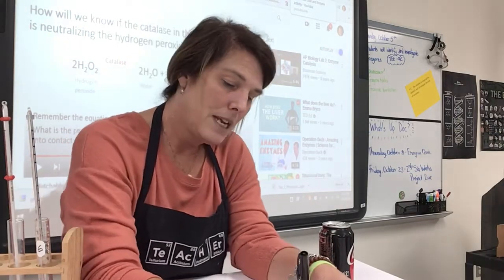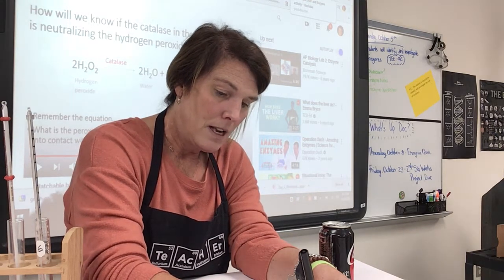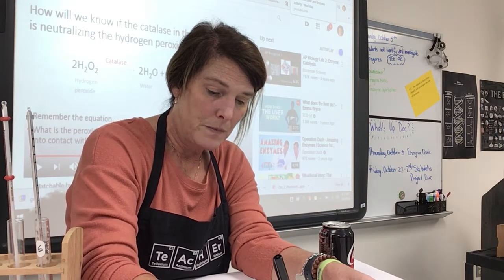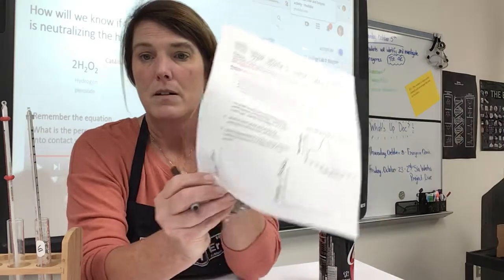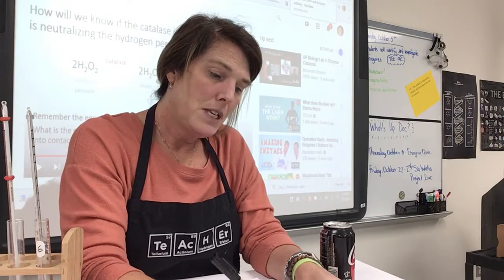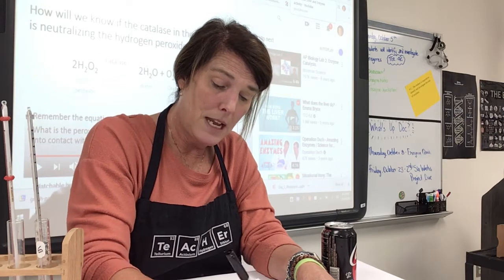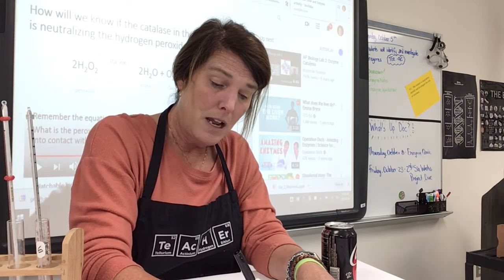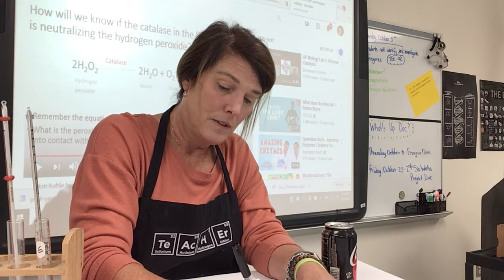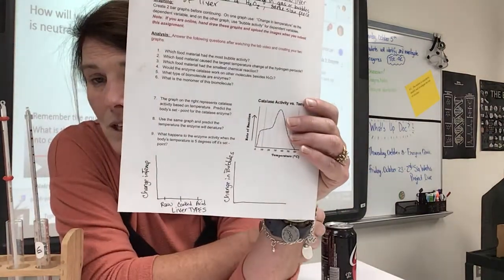One we labeled a change in temperature, and the other one we labeled a change in bubbles. So we have 2 graphs. Down at the bottom, it's a bar graph, and remember we had raw liver as one, we had cooked liver as another, and we had liver kept in acid. So you will need to make room at the x-axis for you to write your liver types.